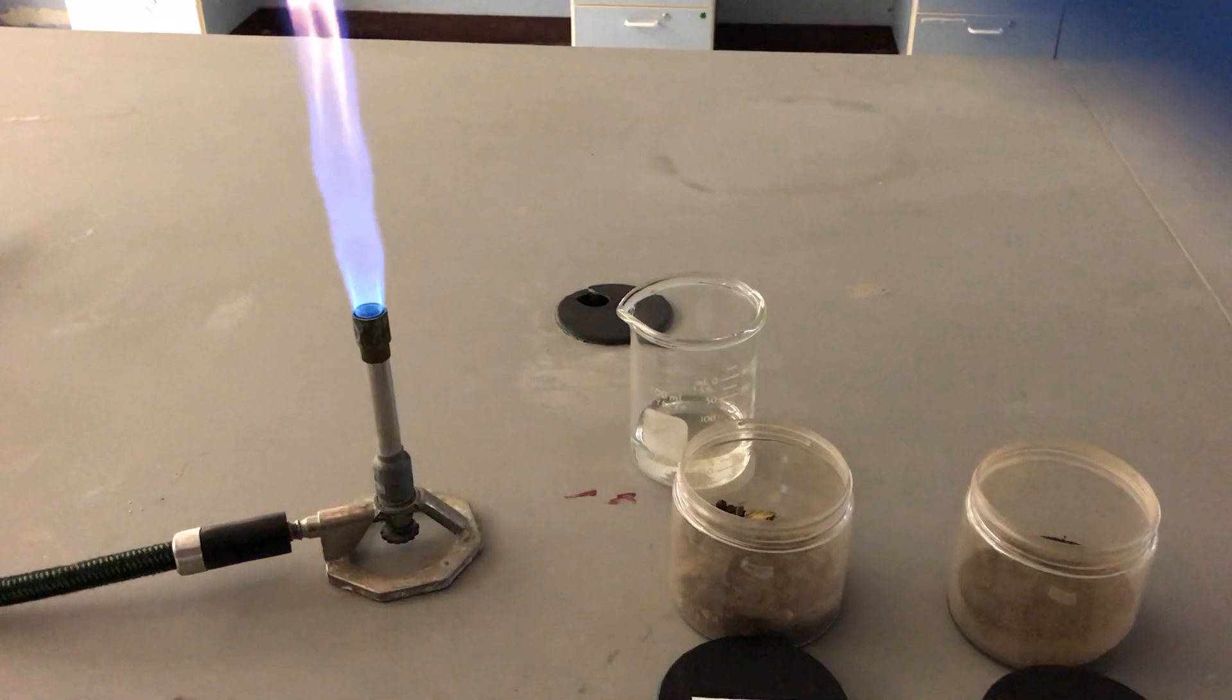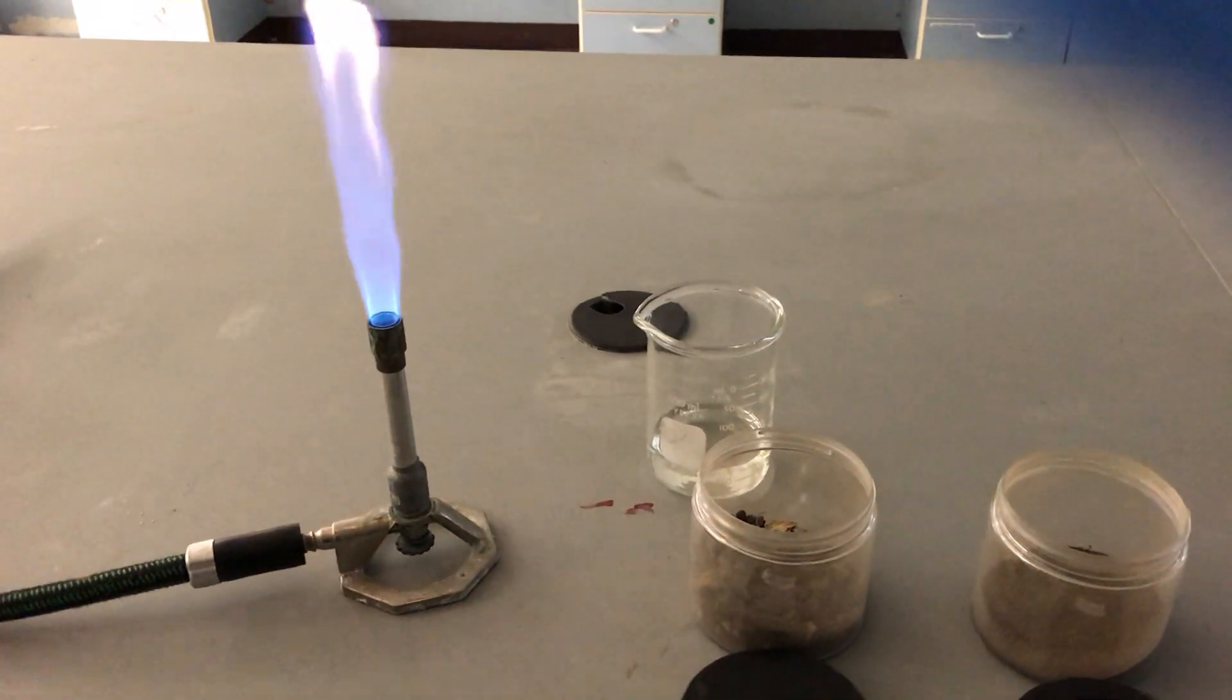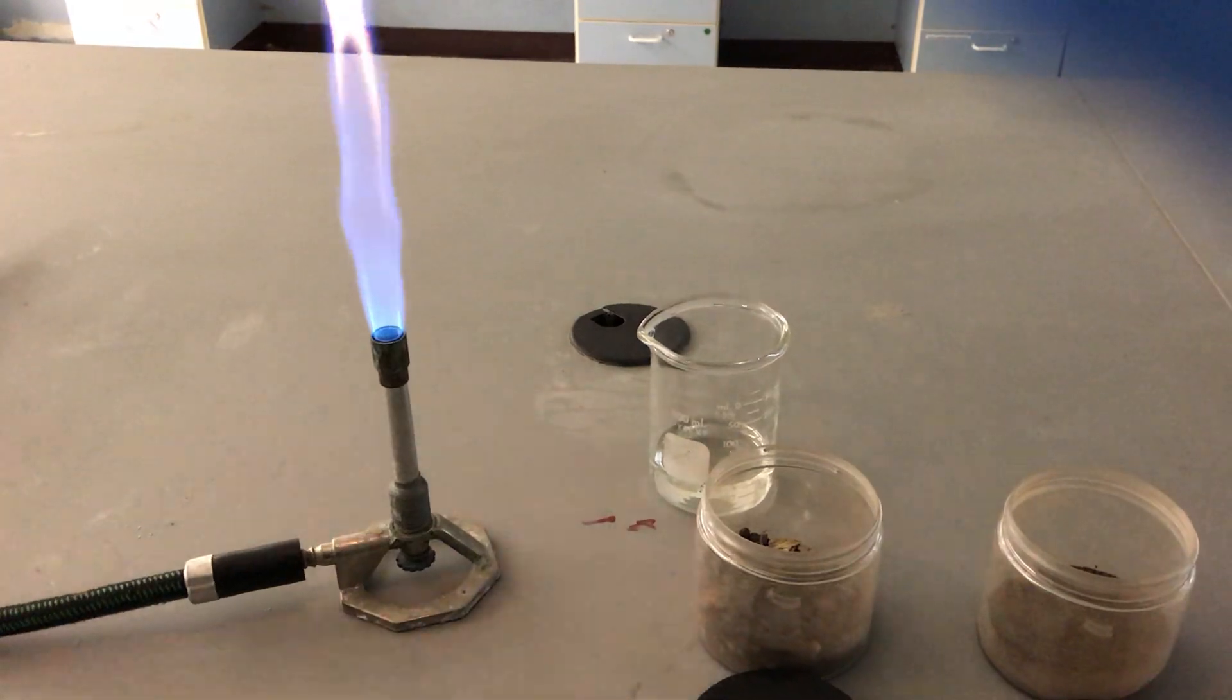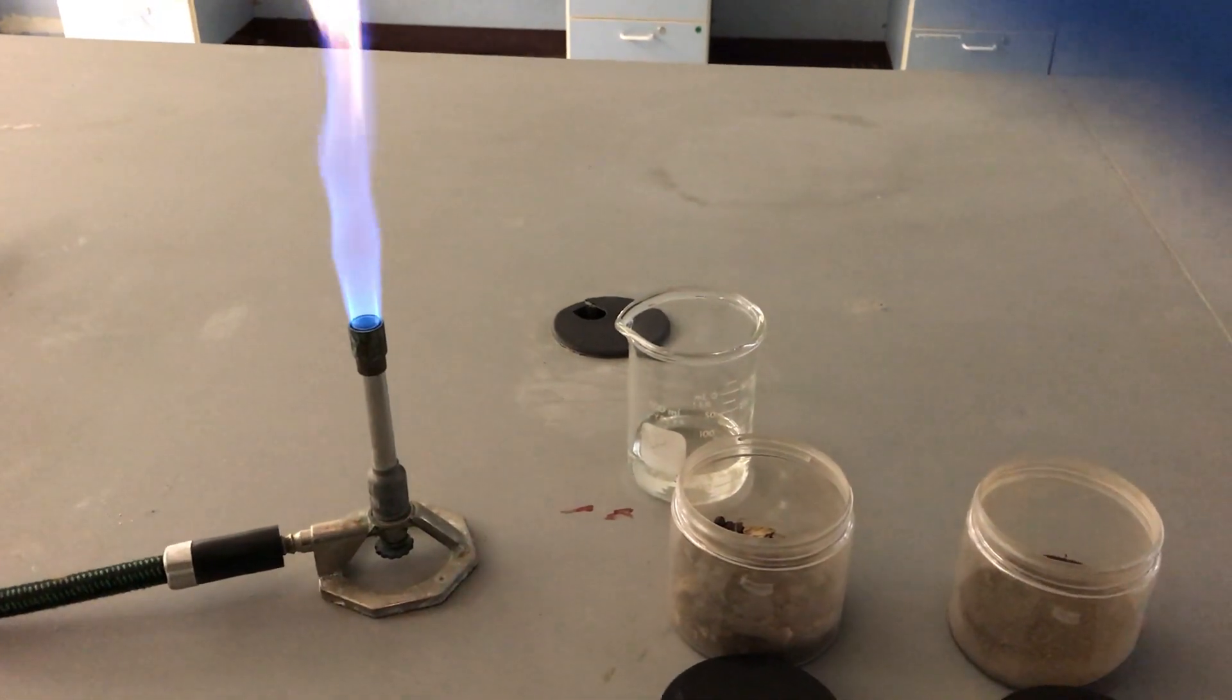So for example if we see orange we might say there's calcium present, or if it's yellow it's sodium. Green would indicate copper or barium, red, lithium or strontium, white, magnesium.